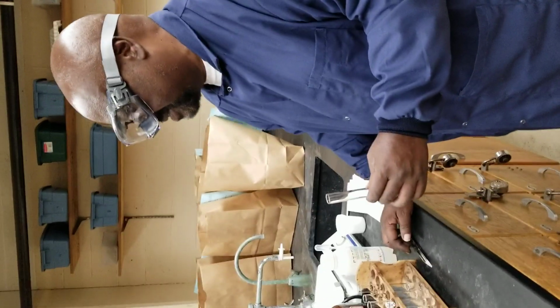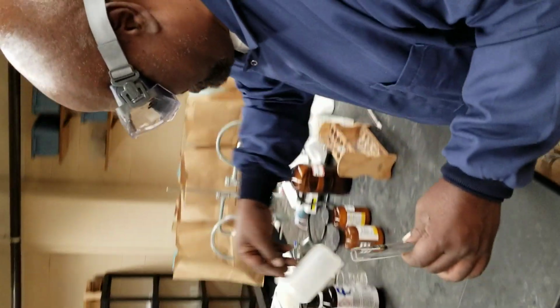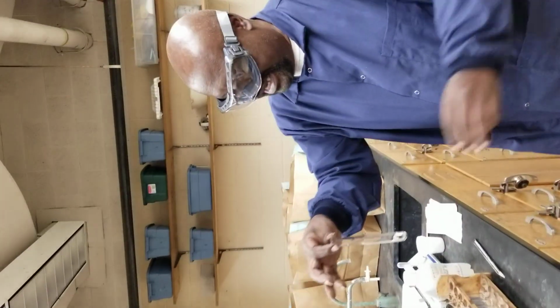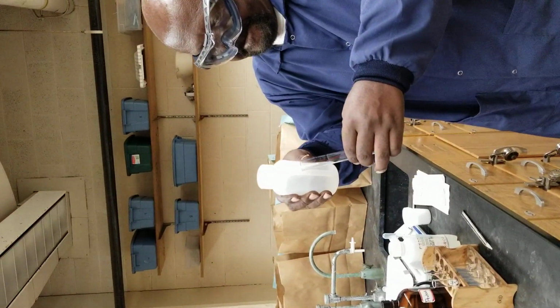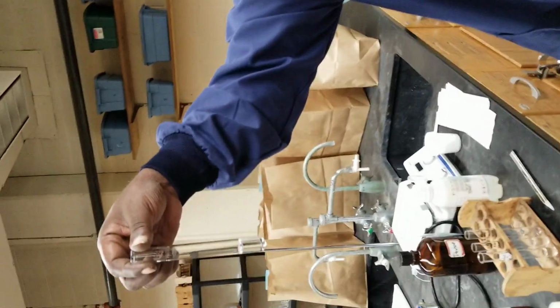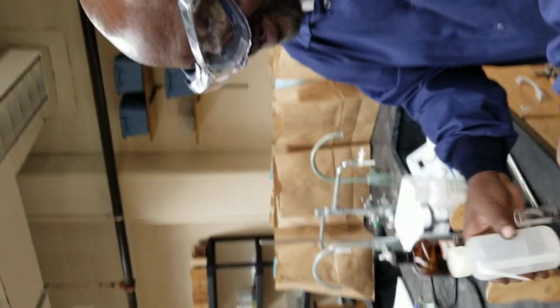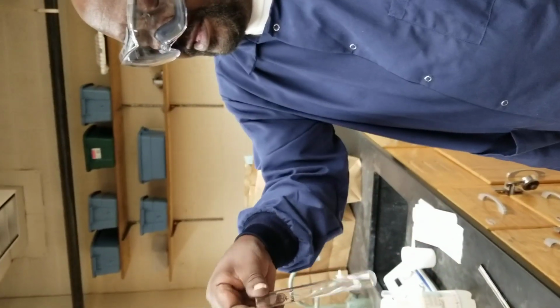It says water in cyclohexane. Grab some water on the other side here without spilling anything. So water in cyclohexane. Use the wash bottle, that should work. I'll put some more, there's a good reason why in this case. Shake it.